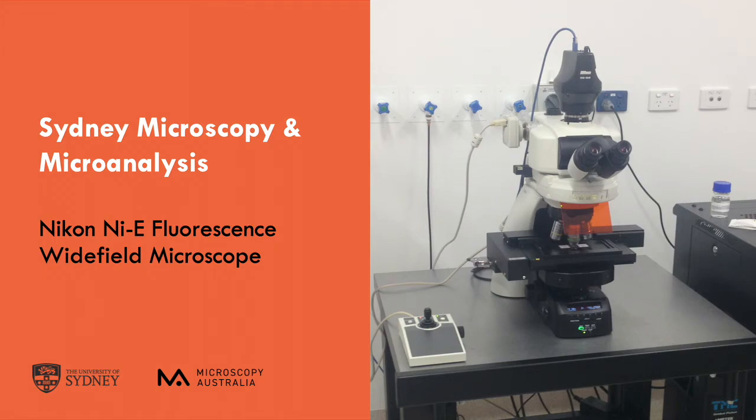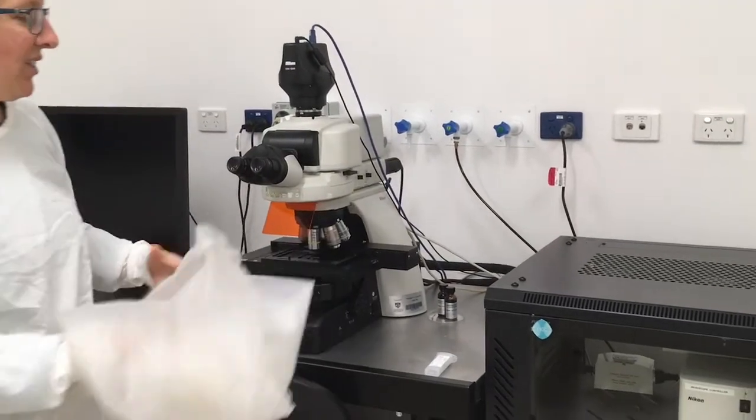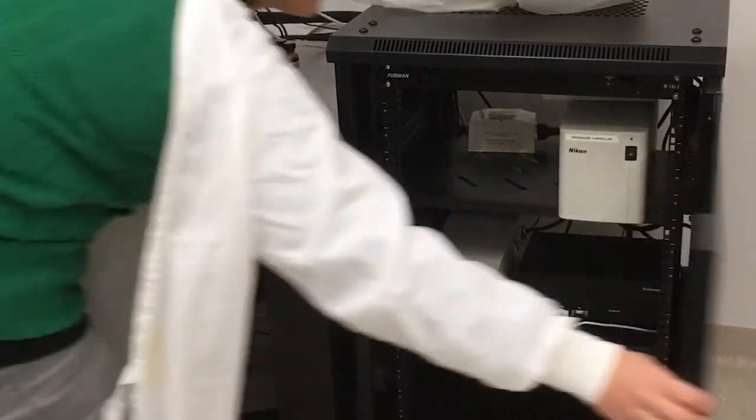To start up the Nikon NiE Wide-Field Microscope, first remove the dust cover and set to the side. Then open the component box. Press the keyhole, then turn the handle to the side to open the door.